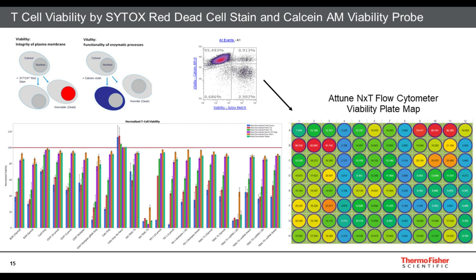So now, moving forward to another level of power that flow cytometry allows for your gene editing cell engineering experiments, and that is it gives you the option to do viability studies as well. And that's very, very important, right? You're doing gene editing, but in the end, you're looking at your cells, your cell health, their ability to proliferate, their viability over time. Additionally, if you're optimizing gene editing experiments, or say the goal is to create gene editing tools, toxicity is very, very important.